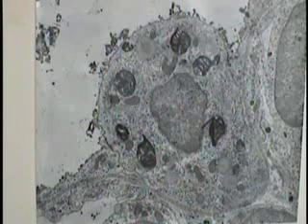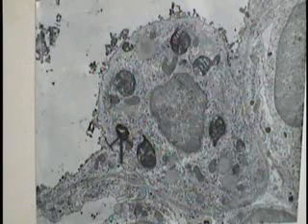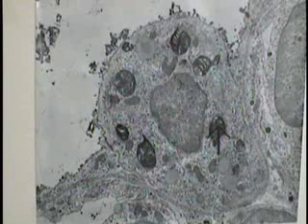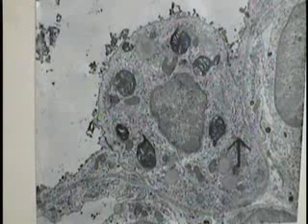So all of these dark laminated structures, hence they're called laminated bodies, or myelin bodies, characterize this type 2 pneumocyte, because this is the position where surfactant is thought to reside within the type 2 pneumocyte. So this is a classic example of a type 2 pneumocyte, a surfactant producing cell from the alveolar wall.